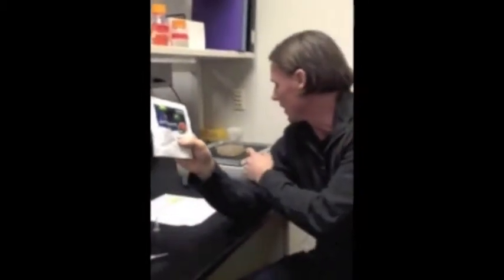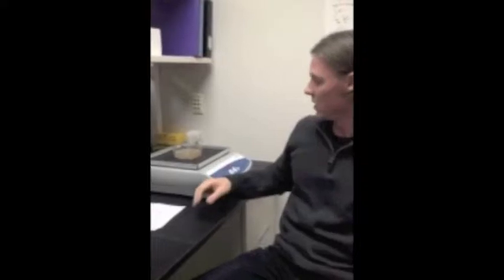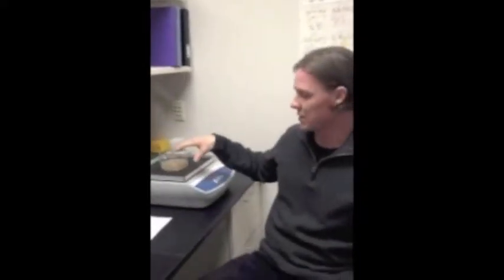So this has to be done at night, or it has to be done with the lights off, please. So we shut everything off and we make the solution, and we put it on the shaker overnight with a box over it. The next day we come in, usually as a group, and we have to do 4 more washes, and that's when we have to take all the tissue in those tiny thin slices and put them onto these slides in the dark. That's actually a process. There's a little bit of swearing that goes on.